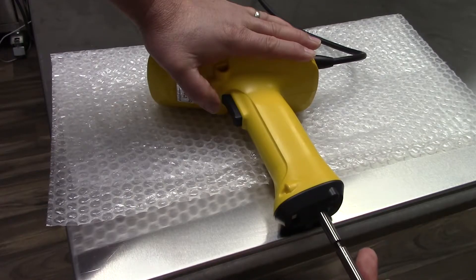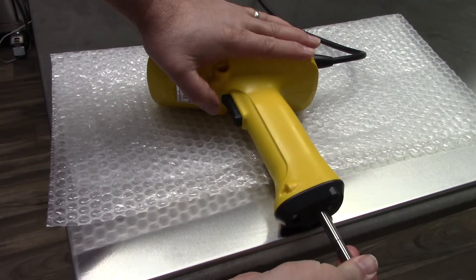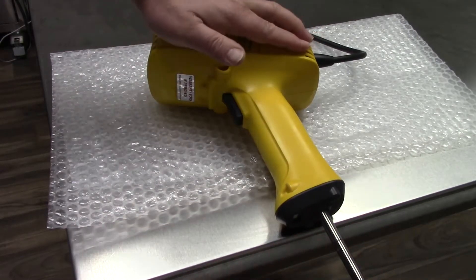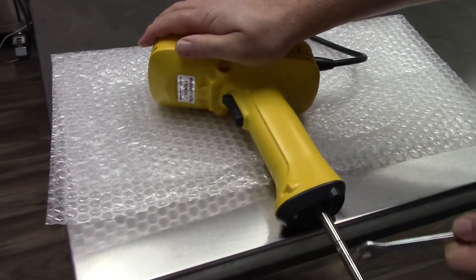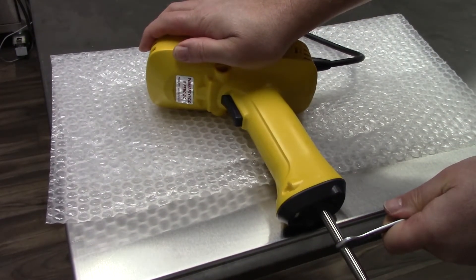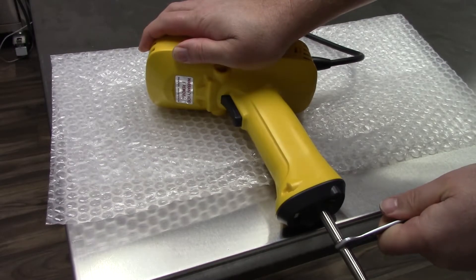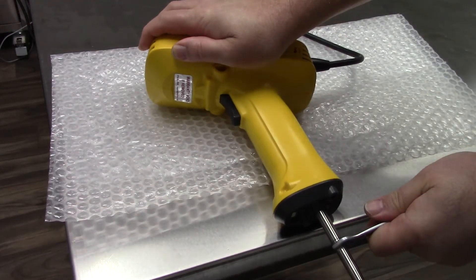For assembly, turning the sonotrode clockwise, I still have force on my left hand. I'm actually going to reverse positions, now putting my right hand on the unit and turning it down, putting pressure on the side.